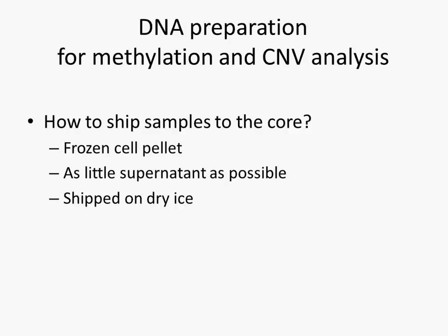For both analyses, the way that we recommend preparing the DNA is to ship us the frozen cell pellet with as little supernatant as possible, and ship them on dry ice so they don't start degrading during the trip.